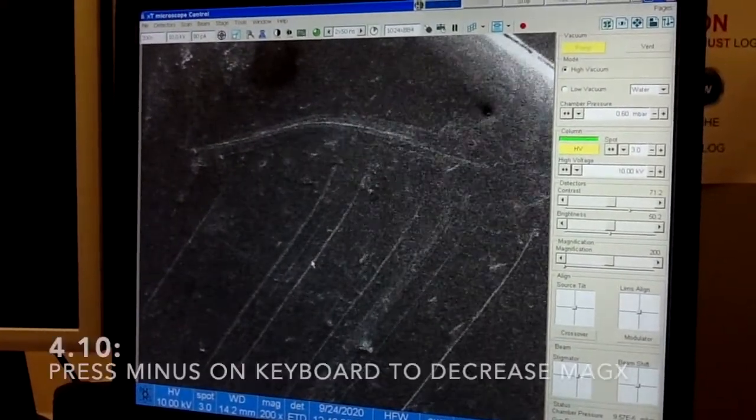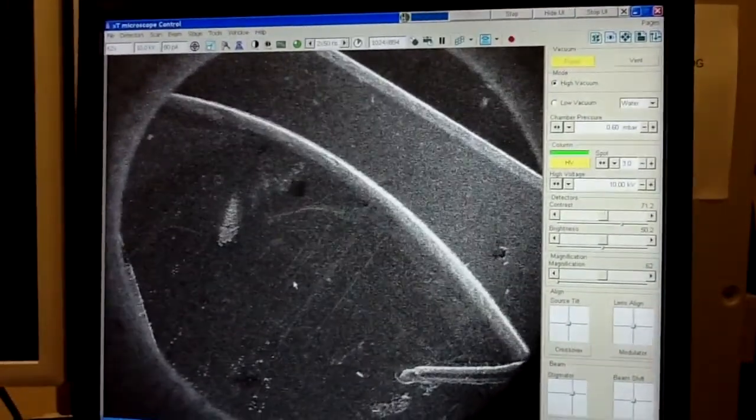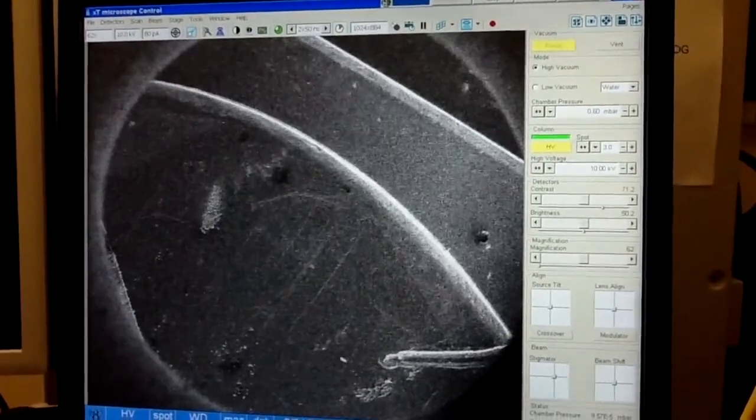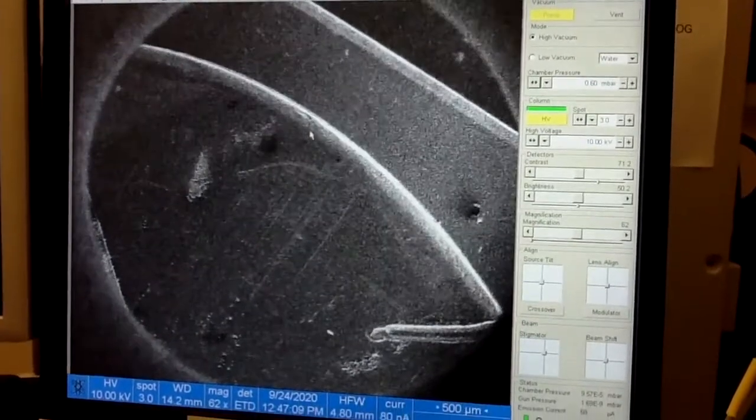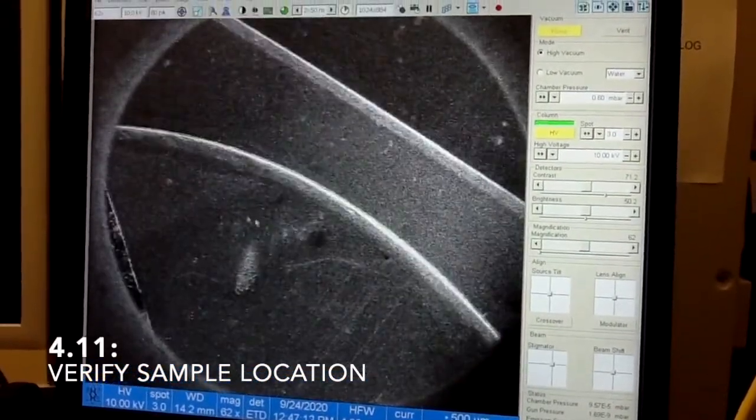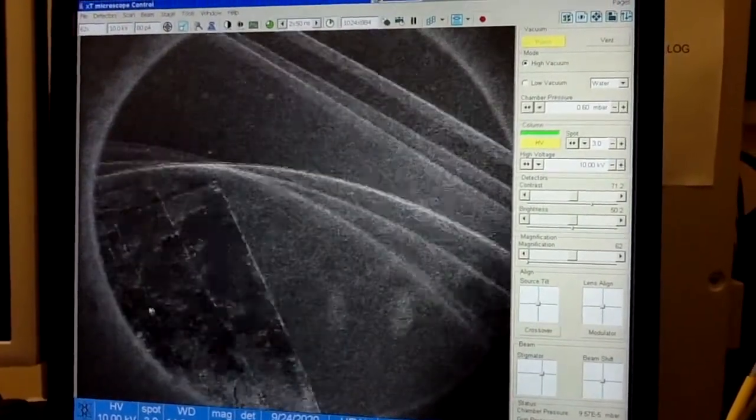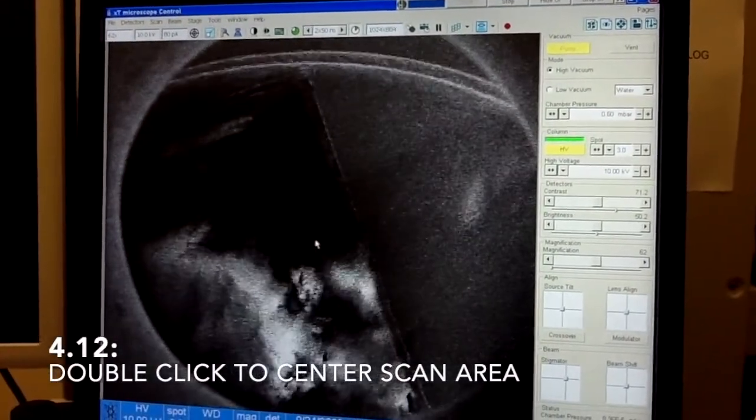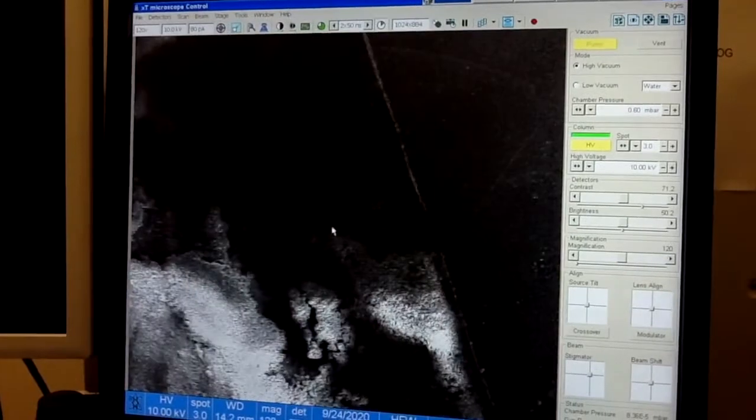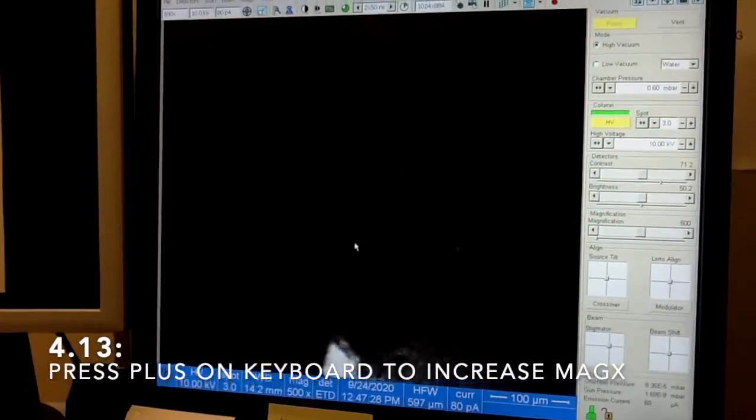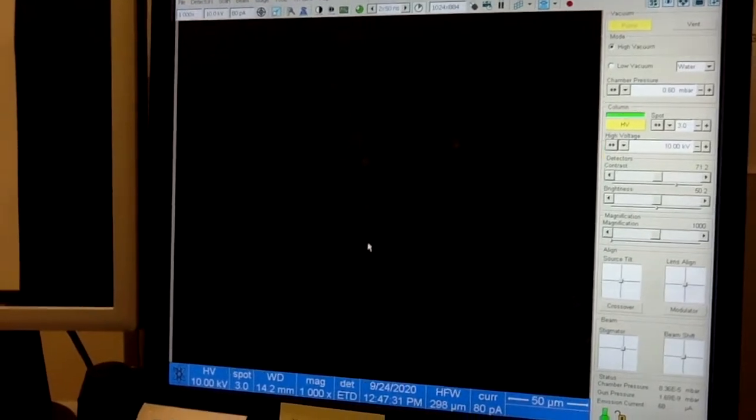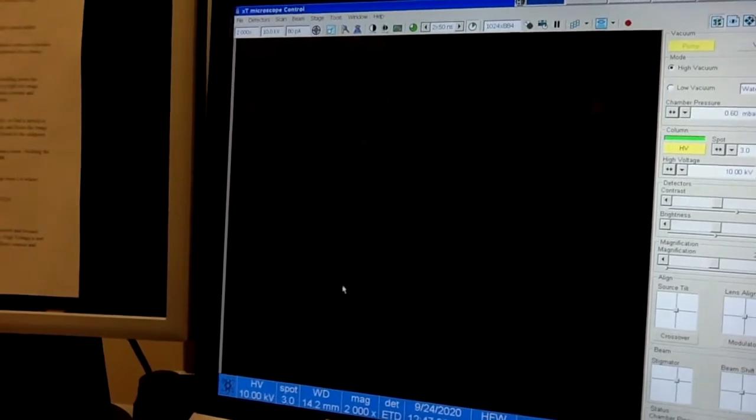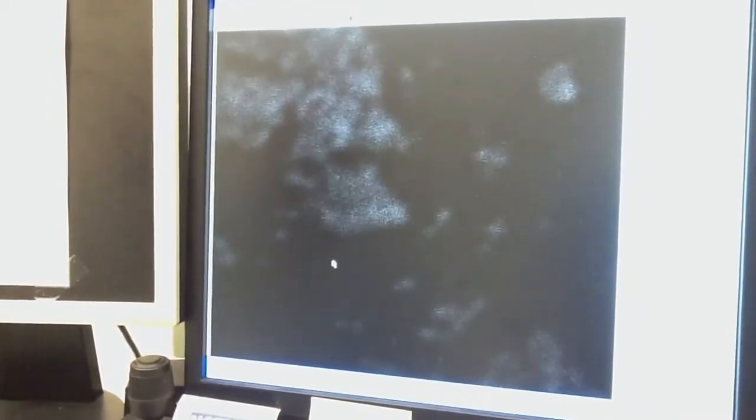Now you want to find your sample first. Lower the magnification. You can use the minus button on your keyboard and it will go all the way down. This is the lowest magnification you can get, which is 62x. Now let's make sure that this is our sample. Okay. It looks like the sample is really here. So we will select this area and we'll try to image it. To increase the magnification, press plus button. Every time you press it, the magnification will increase twice.